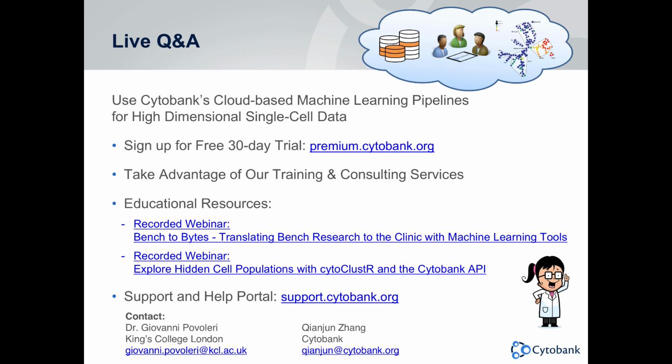The other question I got here says, in Cytobank, do you recommend if different clustering and cell type ID methods give different results? Here, I'll be happy to take this one. Different cluster methods, I'm not sure if you're referring to SPADE versus FlowSOM. In general, SPADE and FlowSOM can have very comparable results.